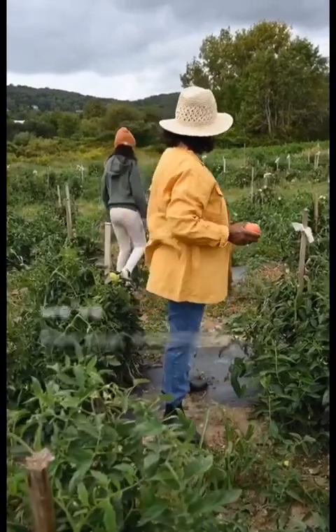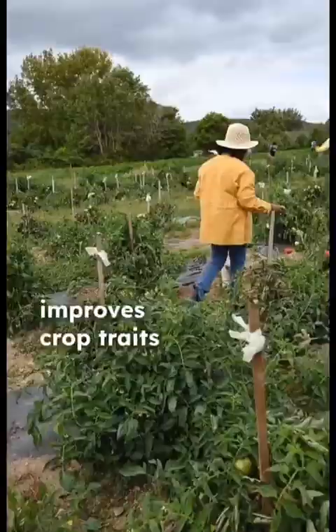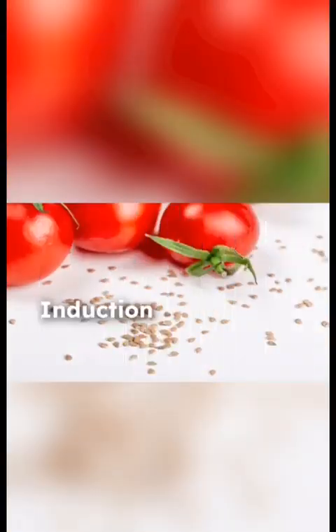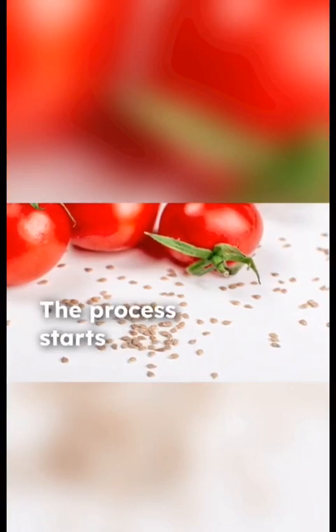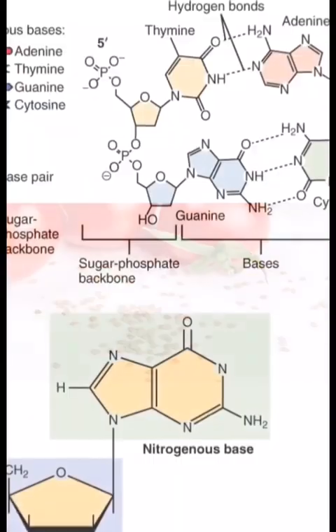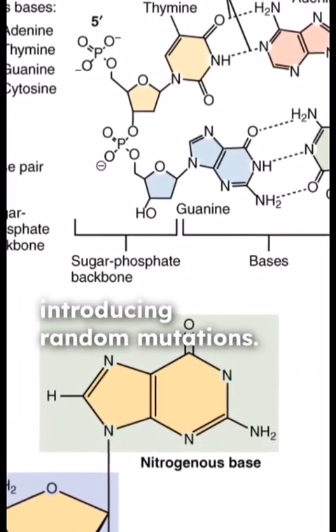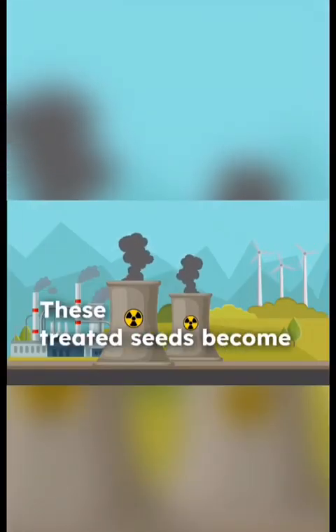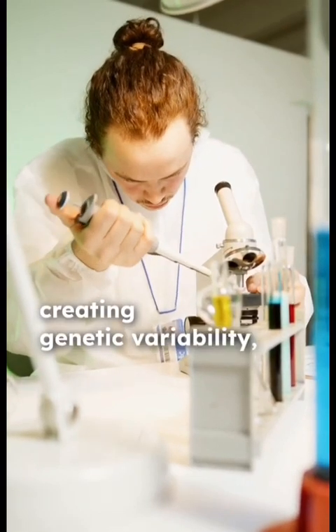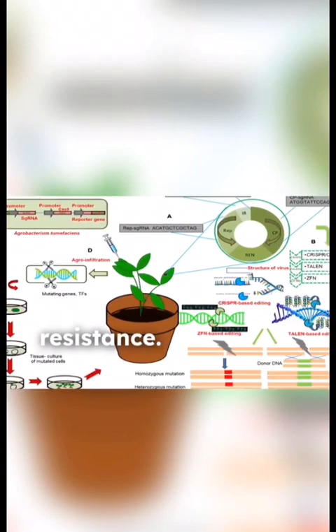For our example, we've focused on tomato mutation breeding, which shows how this technique improves crop traits like yield, pest resistance, and stress tolerance. Induction of mutations. The process starts with treating tomato seeds with EMS, ethyl methane sulfonate. EMS is a chemical mutagen that alters the DNA, introducing random mutations. These treated seeds become the M1 generation. This step is crucial for creating genetic variability, which can result in traits like higher yield or disease resistance.